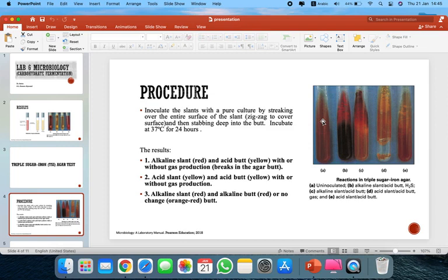So to distinguish between one Enterobacteria and another, I have to use a specific test, right? So this test is specific for that. All are gram-negative, but some Enterobacteria have the ability to ferment the carbohydrate, and the others are not.